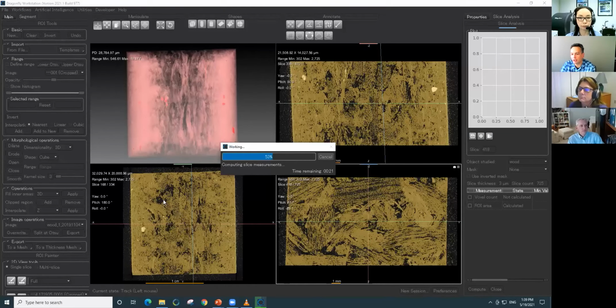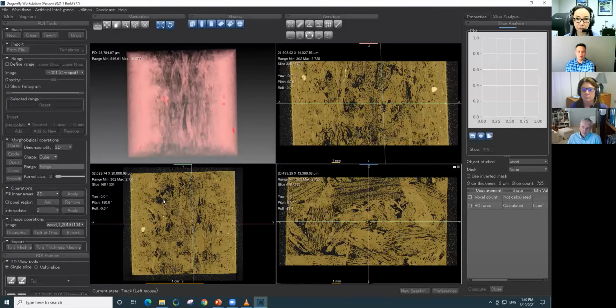All right, Aya, we've had a number of good questions come in. I'm going to hold off on a few of them until the end, but I wanted to ask a couple here. One from Don says, "Is there ever a good reason to use anything other than machine learning for segmentation? Is it just a time consideration, or is it some other reason?" Okay. I'll make a few comments, and I want to see what Mike has to say about this question too.